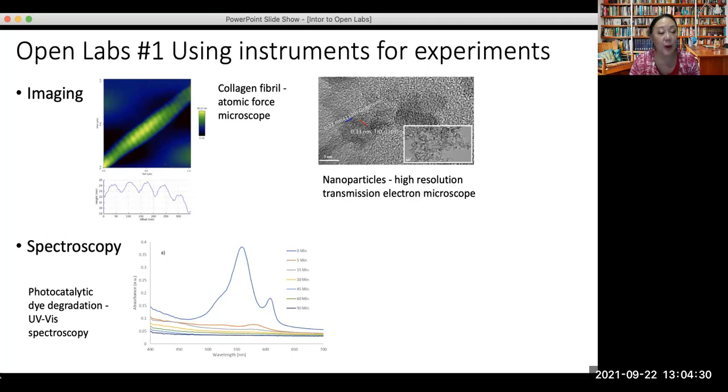The other experiment that you will be seeing in your video is about spectroscopy. And I think you've encountered spectroscopy already, perhaps in your NMR and your IR in some of the other courses. It's about being able to look at the energy levels, the transition between energy levels, and to then learn about your sample by looking at the spectra. Now, spectroscopy is way beyond IR and NMR, and you can actually learn a little bit more in the videos.